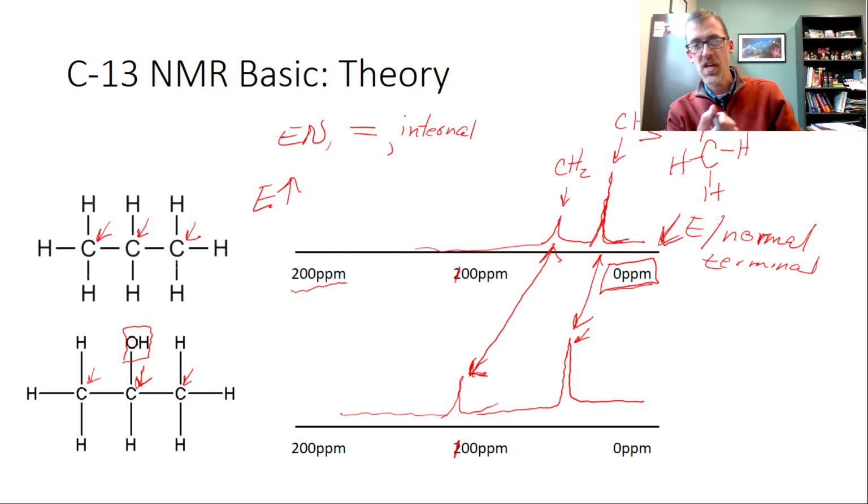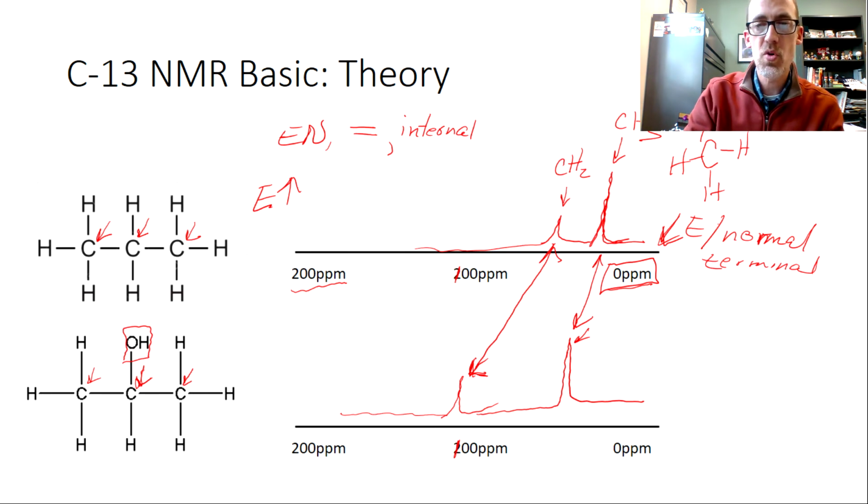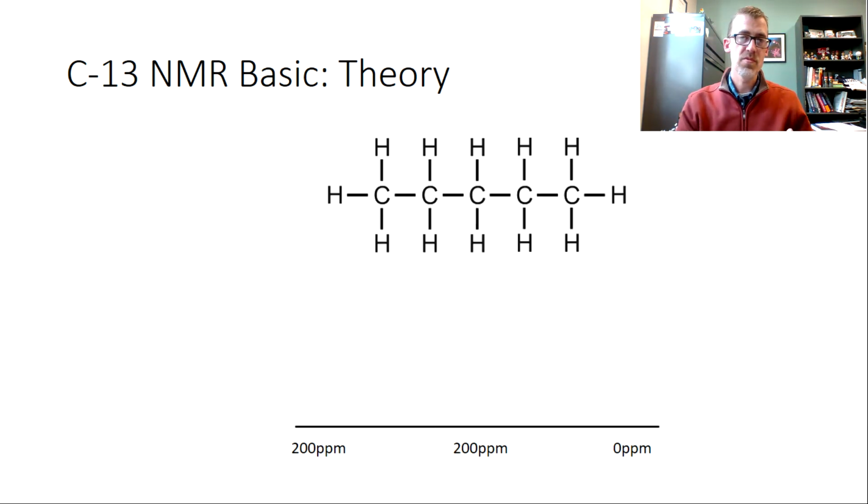And in case the common name is isopropanol, this is rubbing alcohol that you would maybe have in your medicine cabinet. Alright, so I just have one more. We'll kind of just round this up. So a little bigger molecule. It's certainly not very complicated, but we see symmetry. This is pentane. So we have 1, 2, 3, 4, and 5 carbons.